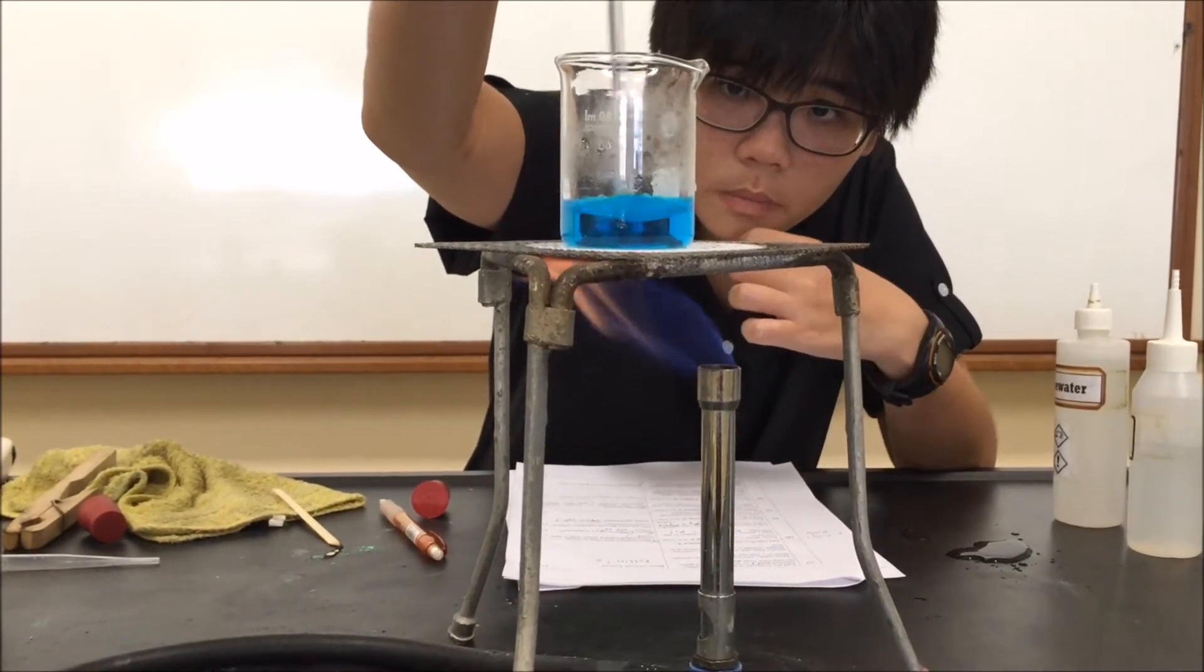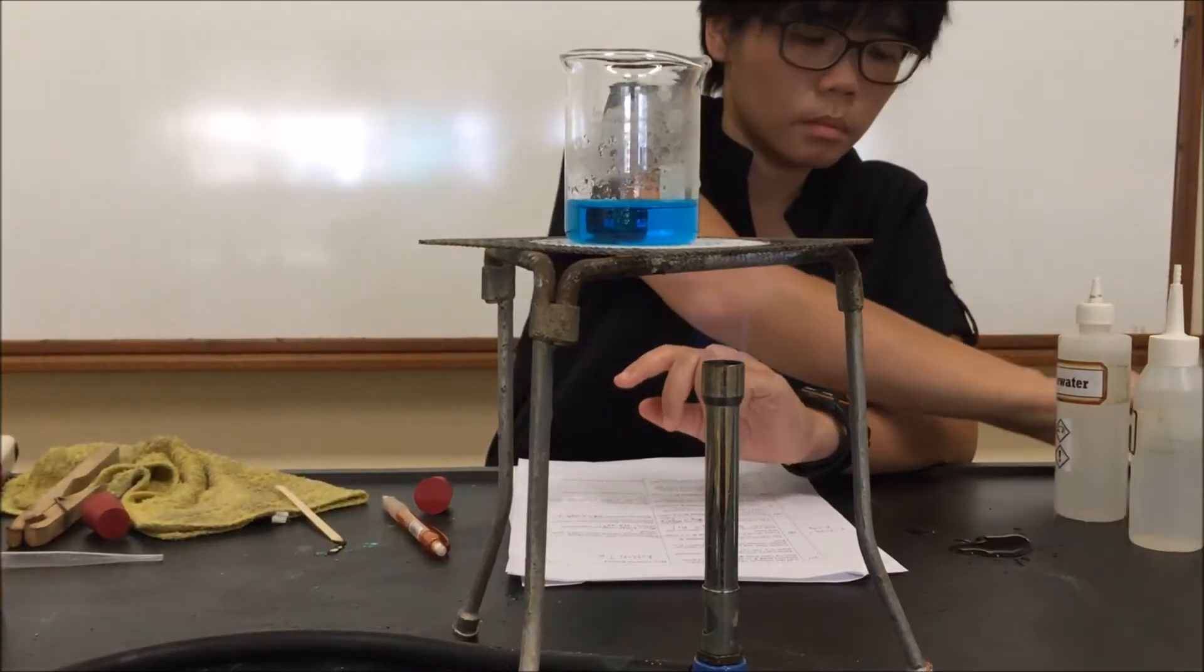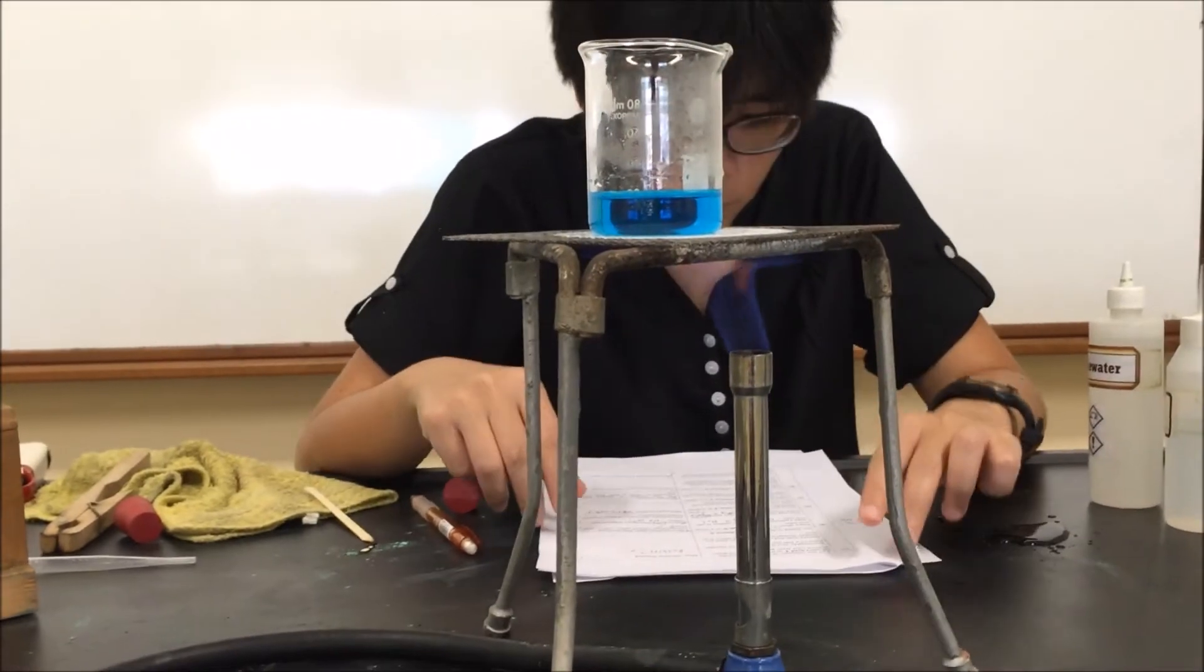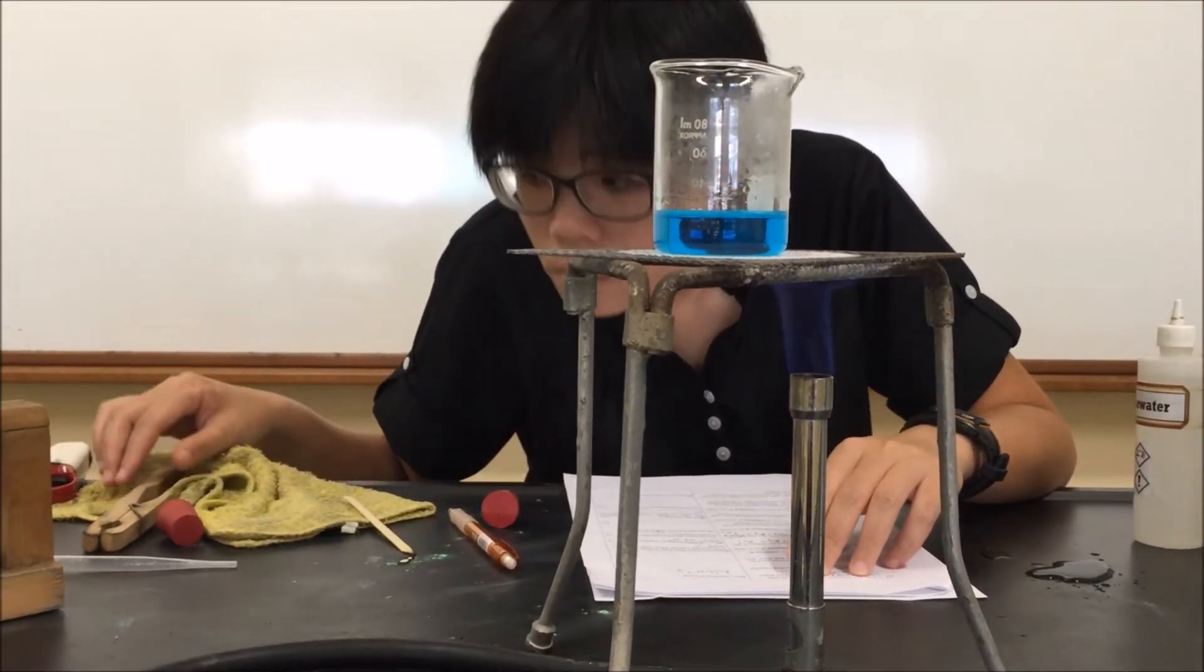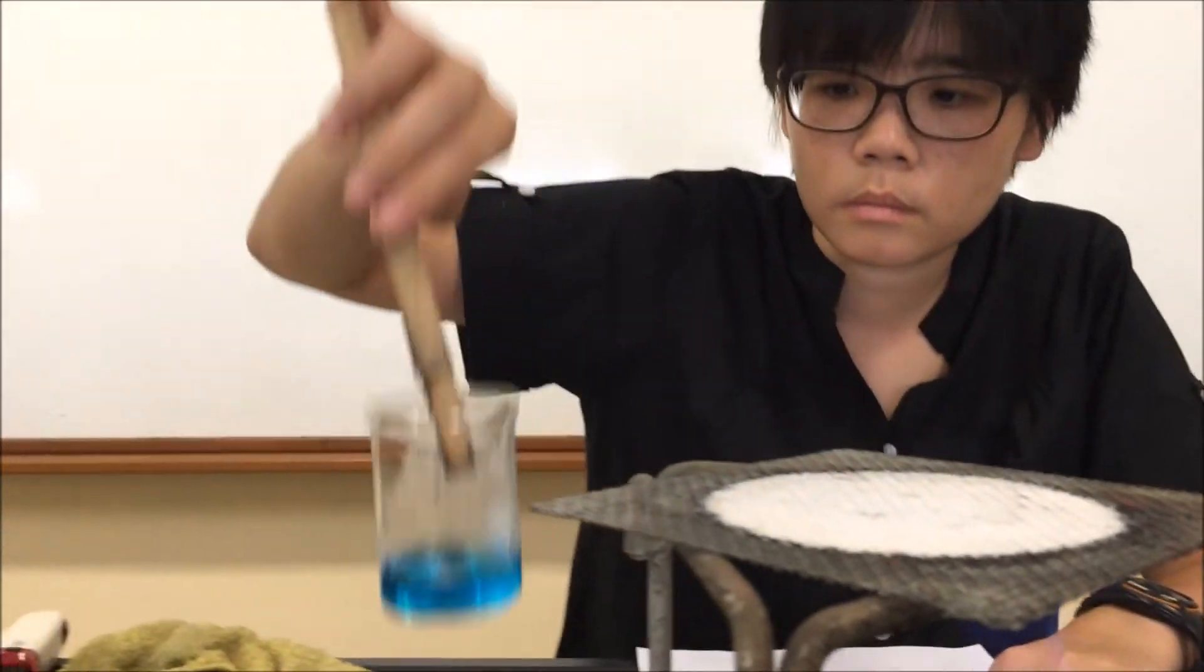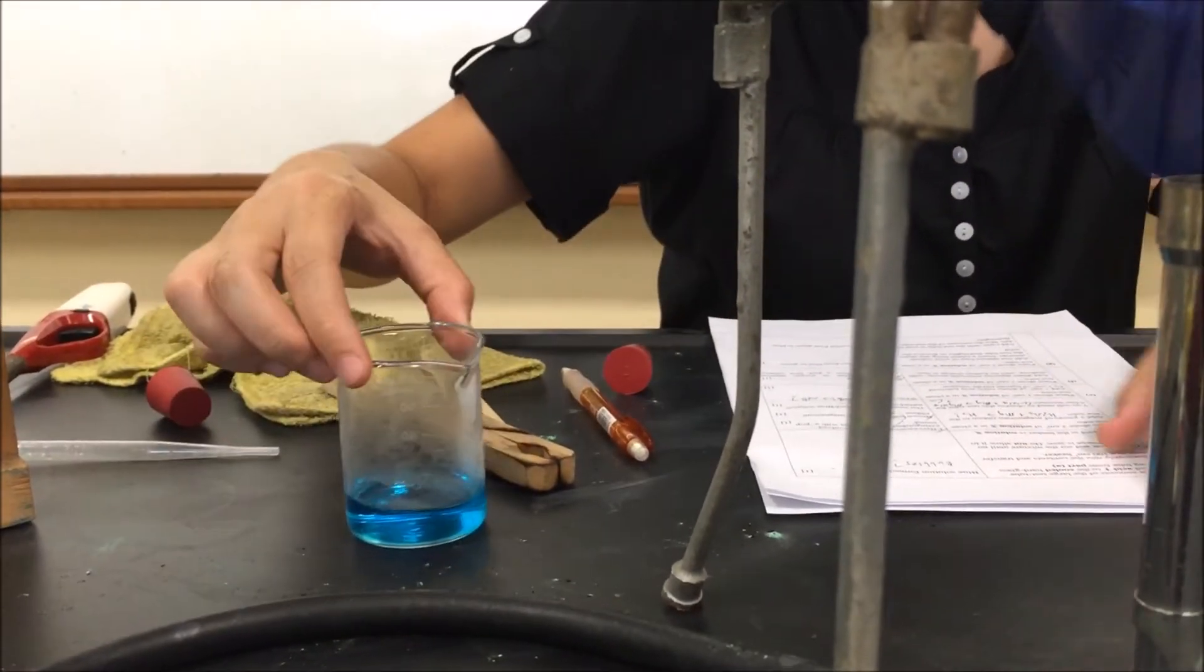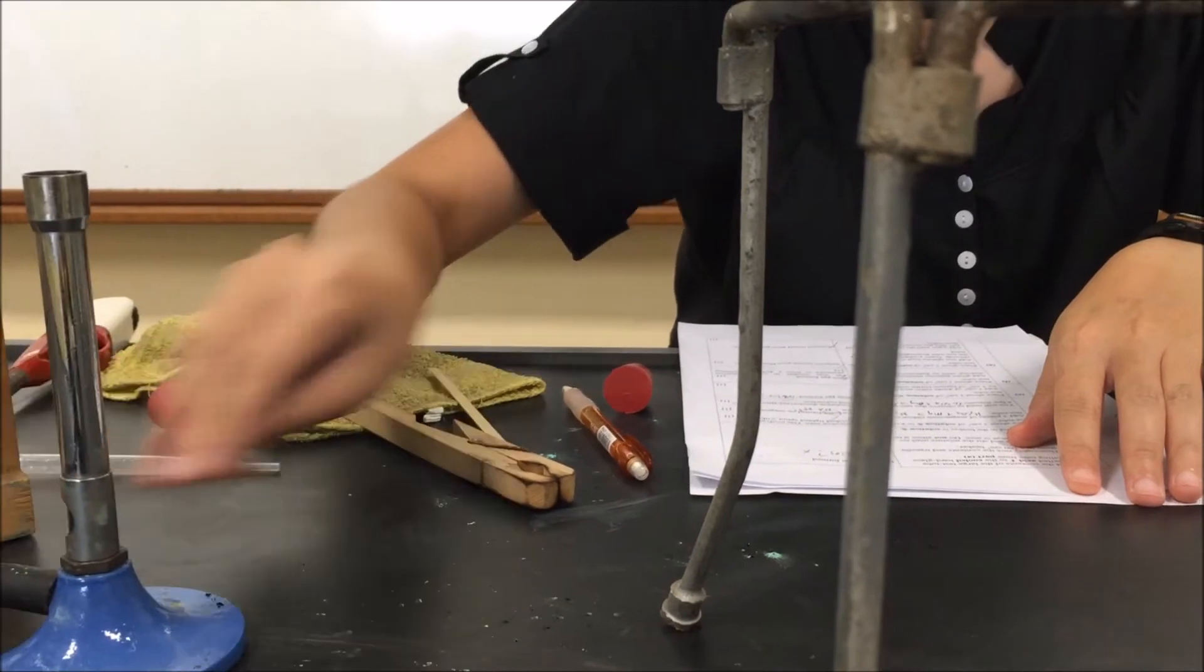We are now supposed to allow the liquid to boil. So we just heat it for a while. And then carefully remove it from the stand. And we will continue with the experiment. So the Bunsen burner and the retort stand, you could organize your bench, make sure that you have enough space so that you can carry out the experiments correctly and safely.